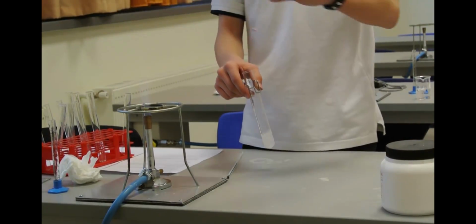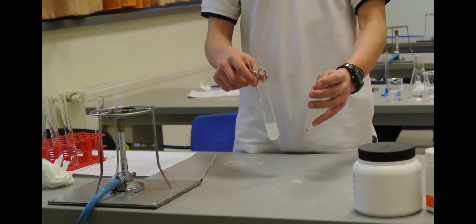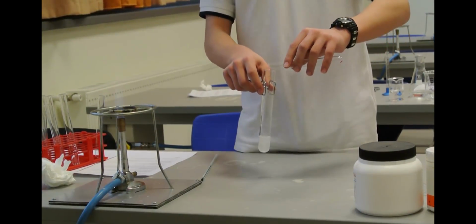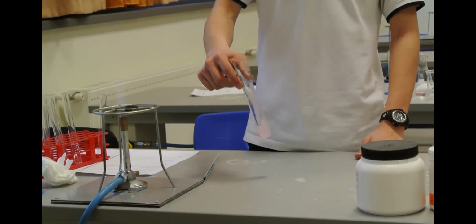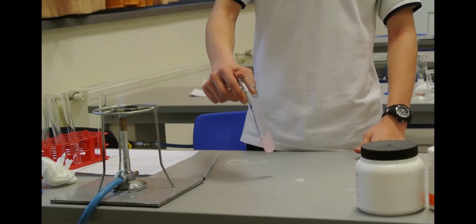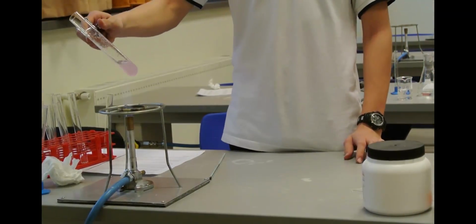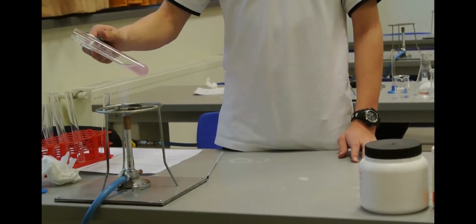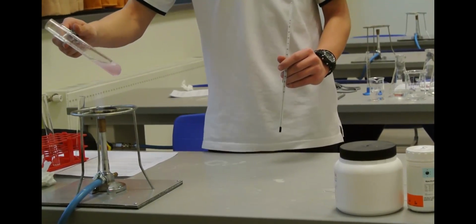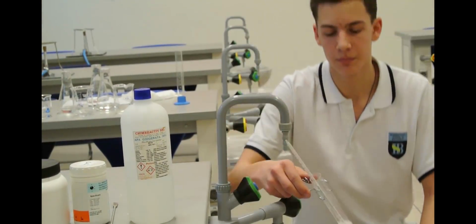Okay, so now that it has dissolved, I will add a bit of cobalt chloride, which will be the catalyst. And I will stir it until it dissolves a bit. And now I will heat it. Okay, so now that it started fizzing, I will put the thermometer in and take it over the sink.